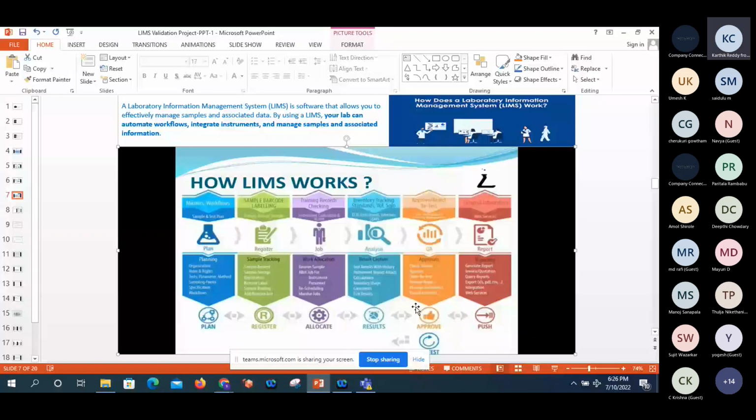So there is an inventory management module also. It should be manageable through LIMS only. The inventory management module handles huge numbers of chemicals, reagents, volumetric solutions, and working standards. All this can be easily managed here. And once the test report is there, there is an approve or reject test report step. The QA approver can approve the COA generation, some of the trend reports and stability summary reports, everything. Once the data is generated, an archival system works on the system, and it is saved into the central server system.